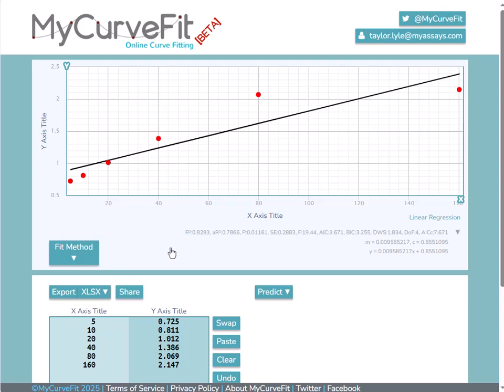This is confirmed by a second tool for assessing the validity of the fit, the R-squared value. R-squared is an intuitive and relative measure of the fit, providing information on how much variability in the fit the model explains. The closer to 1, the better the fit. So with this information, I'd say we're looking at a data set that is more sigmoidal in nature.